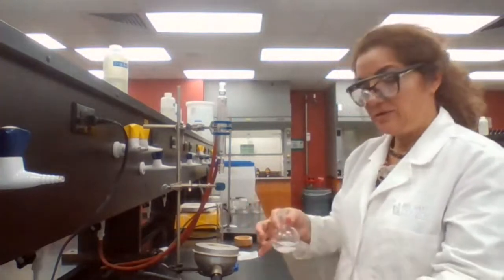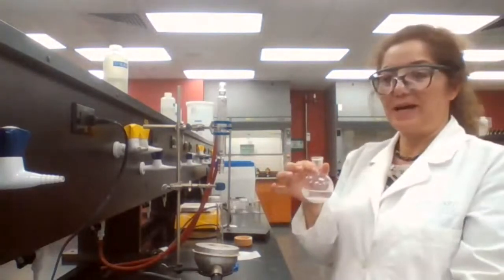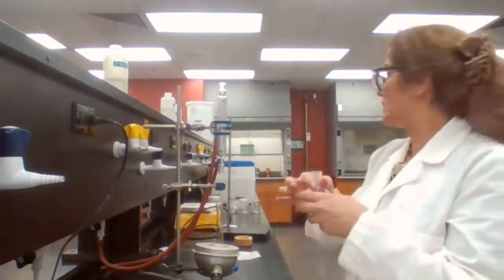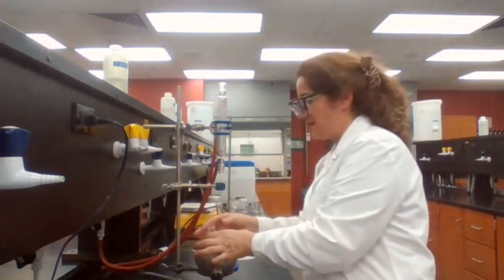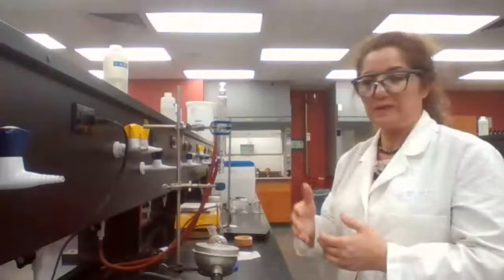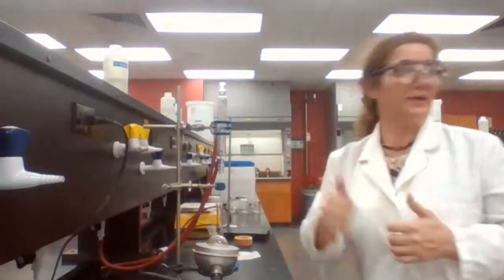Okay, and I need to add the 3 milliliters of concentrated sulfuric acid. Concentrated sulfuric acid needs to be added inside the fume hood and slowly. So I'm going to have to take the laptop. That's why I'm using the laptop today. I'm going to take the laptop closer to the fume hood so you could see the dispensing slowly. And because it's sulfuric acid, I need my gloves first.